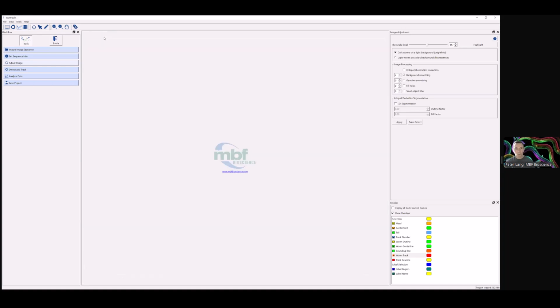So it's just a few examples of some of the parameter and video optimization techniques that can be used to deal with special circumstances associated with videos. Again, the WormLab imaging system is designed to really acquire optimal videos right out of the box. But WormLab is available as a software-only solution too. So if you have your own acquisition system, we can try to give you some guidance on what would work best from an acquisition perspective, and then optimize parameters to work with your particular acquisition conditions.